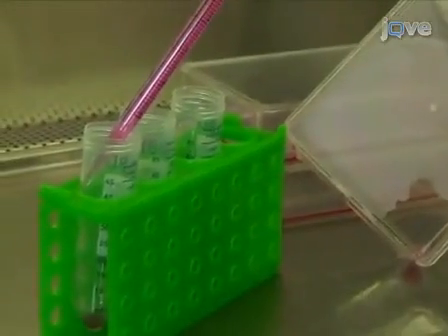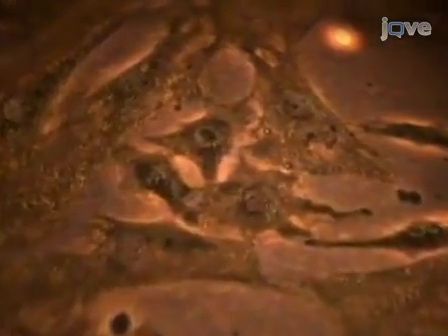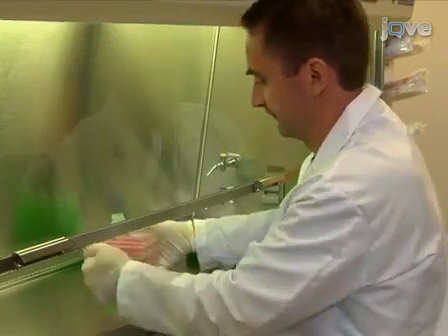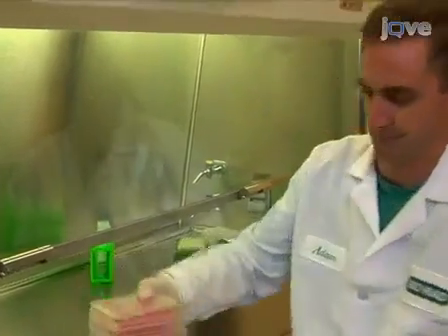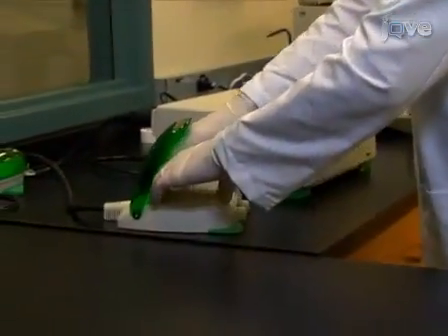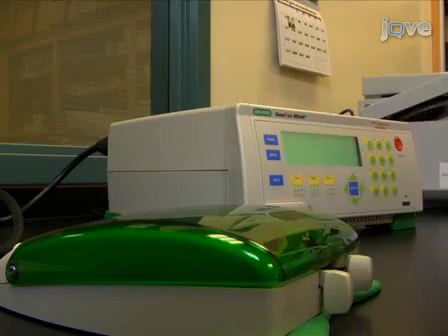Today I'll be using three different passage numbers of MEFs, or mouse embryonic fibroblasts. I'm using different passage number cultures for two reasons. First, I will show how important cell health is with primary cell lines. Even just a few extra days in culture can make a difference to transfection efficiency. Second, I want to show that the process of identifying the best conditions is the same, even though the efficiency of transfection drops off with the older cells.